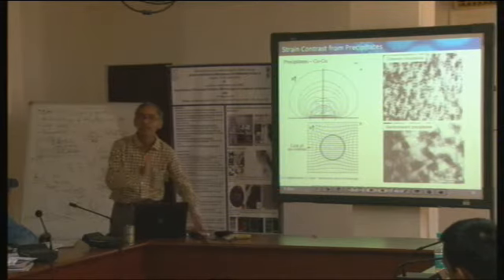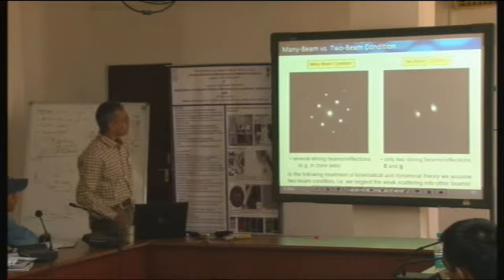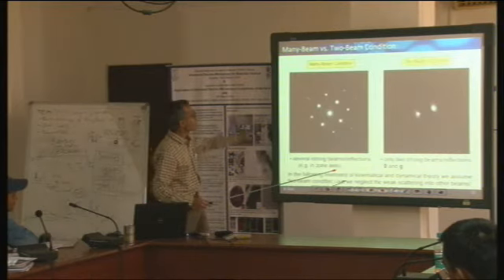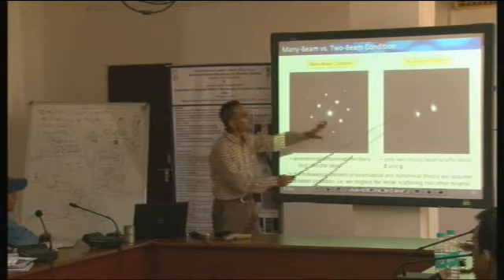It's alright. So we have understood quite a bit of it. So that's so far alright. And here again, I was not knowing whether I will get an opportunity to talk about two beam conditions or not. Then this is a many beam zone axis pattern, or many beam pattern. This is a two beam pattern.